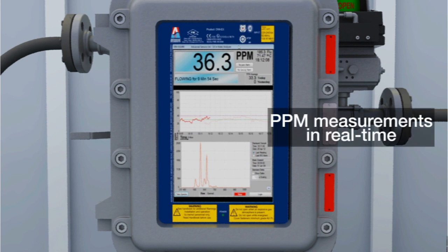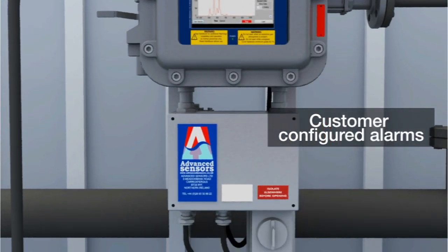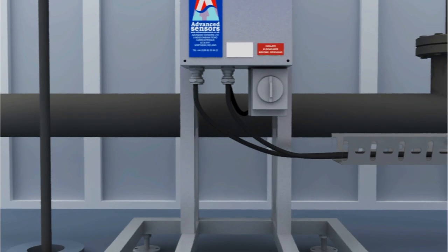Real-time PPM measurements are displayed, along with trending PPM over a configurable timescale. If customer-configured alarms are broken, the analyzer will report through a number of avenues.